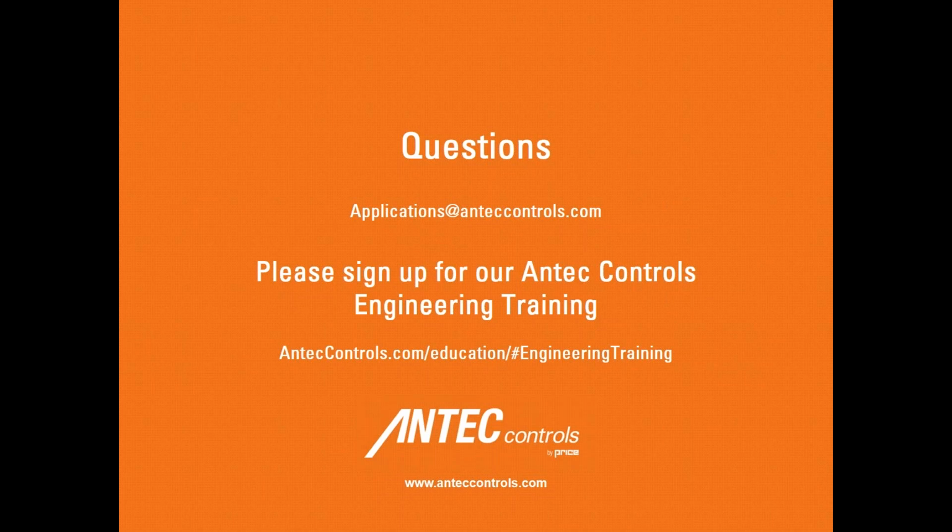The first question is, is there a standard that dictates a minimum fume hood CFM when the sash is closed? Yes, this is actually defined in another section of ANSI Z9.5 that we didn't discuss today. Thank you, Mike. Second question is, is there a testing requirement to measure the velocities near or flowing across the hood face? Yes, there are in many of the standards guidelines for measuring the cross flow in front of the fume hood. Those do exist within most of the standards as well.